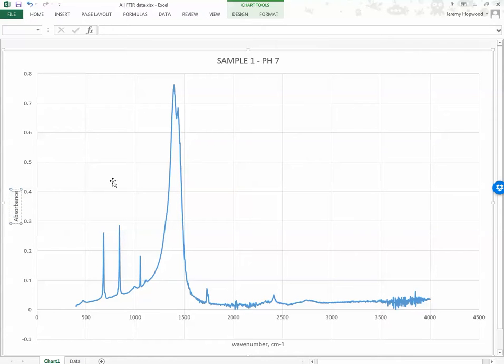Absorbance. Okay. Now you'll notice at the moment I've got absorbance here, wave number here, there's my graph here. When you're giving any reports, people like using colour, but the fact is that when we publish it, unless it really means something, it's better to give graphs in black and white. Particularly because if you've got a graph in red and then a blue, it implies that there's something different between the red and the blue. But it's better really just to show them all in black.